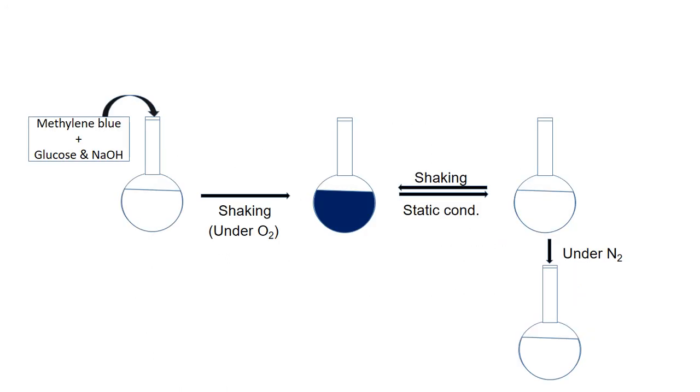And next, I mentioned this slide because this slide is actually one of the proofs that in presence of oxygen blue color appears.